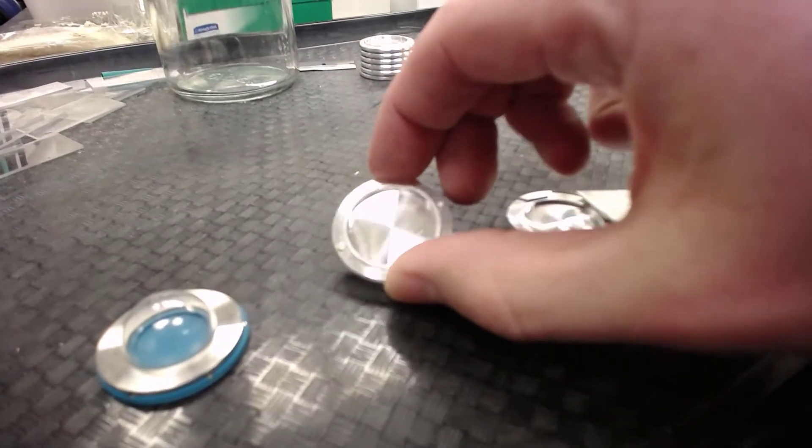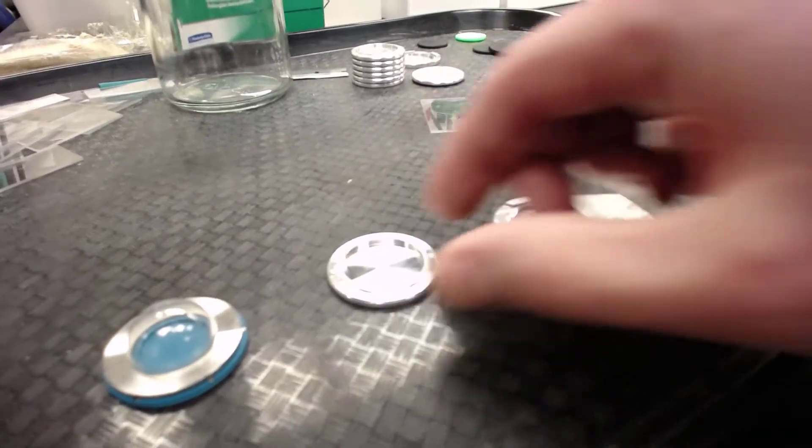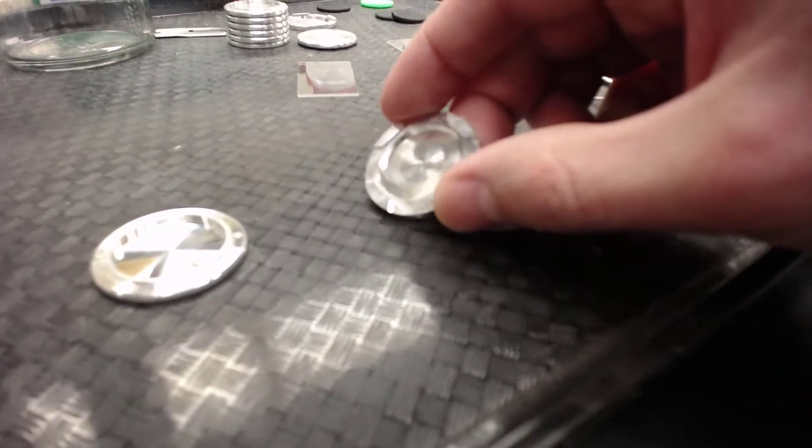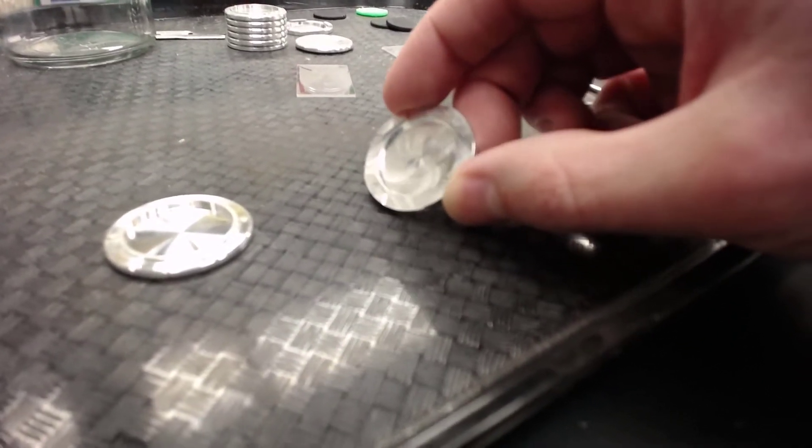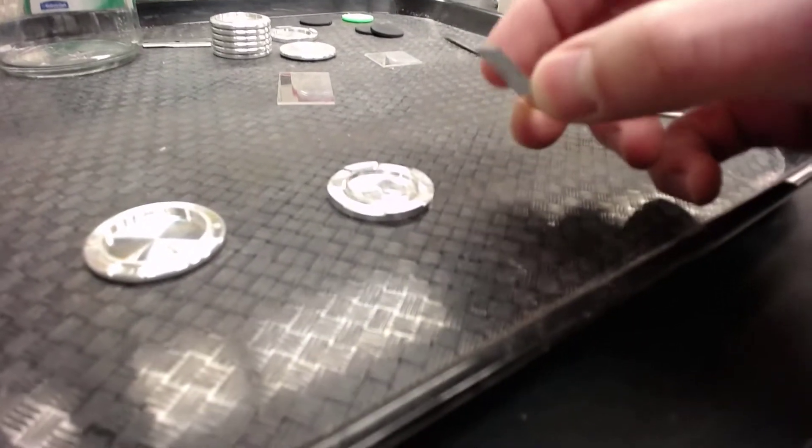This one you can see has a well in it where the powder gets packed into. And then the one on the right is actually our custom made holder for holding one inch by one inch slides or squares of our metal in this case.